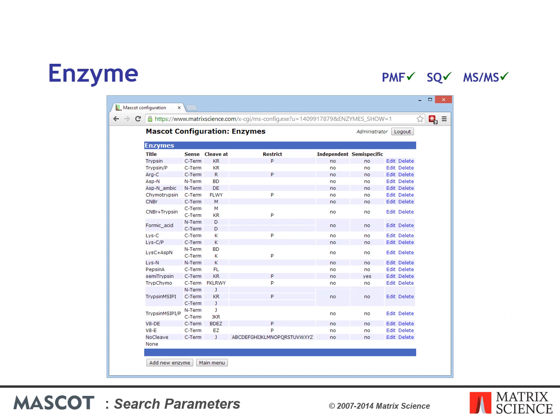The list of enzymes is user configurable. Standard entries are described in the help. If you wish, you can modify the definitions or create new ones using the configuration editor.